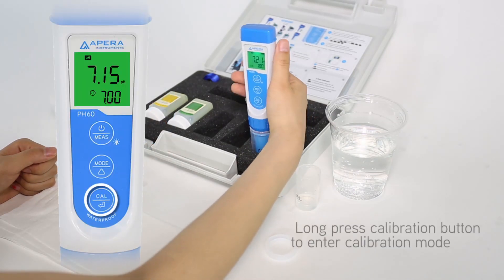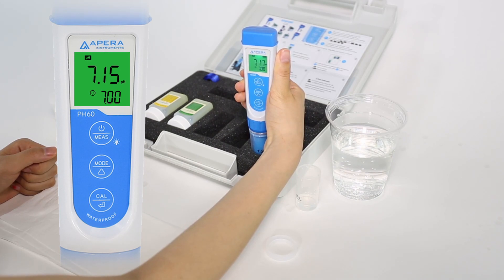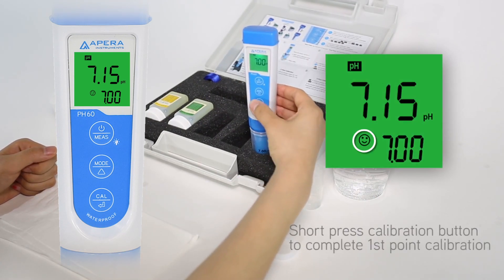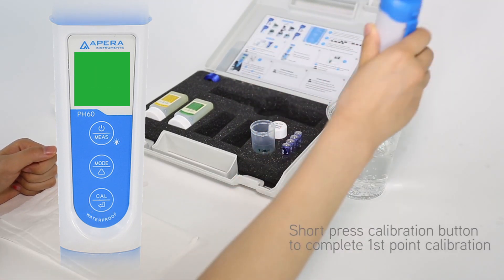Long press the calibration button to enter calibration mode. Gently stir and then allow it to stand still in the solution until the smiley face comes up. This indicates the reading is stable, and then short press the calibration button to complete first point calibration. The tester will then return to measurement mode.